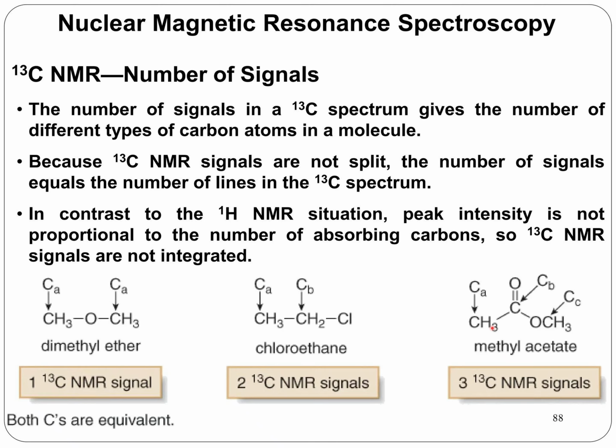Then methyl acetate. Okay, so one carbon, two carbon, and three carbon are present, that is three environments, so three peaks will appear, but these three peaks would be in different places. For example, we know the carbonyl group is located between 150 to 220, so it would be a single sharp peak at around 200. Then the carbon attached to the O means its location would be from 50 to 100. Then CH3 means it would be within 0 to 50.